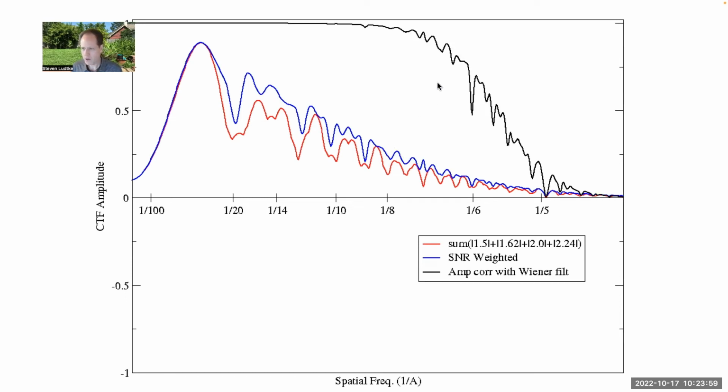When we throw in the Wiener filter and the CTF correction, then that takes the curve back up to sort of the 1 where it should be correctly. And then it's only at high resolution where we just don't have much information at all, where the signal begins to sort of damp off. And you can see these little glitches here. These little glitches are because we didn't sample enough different defoci on the microscope to really sort of smooth things out.